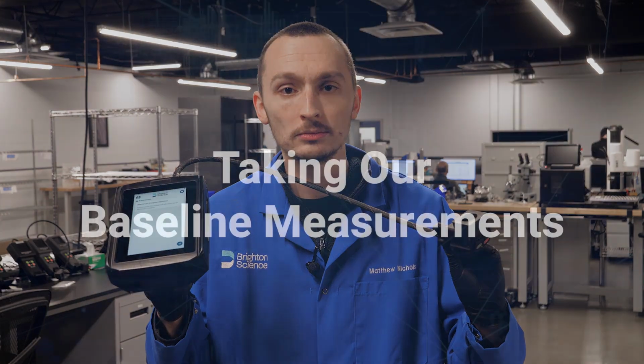One of the central aspects of maintaining a high standard of quality is intelligence and knowing the state of a surface. The tool that we'll be demonstrating today that quickly and reliably gauges the state of a surface is the BConnect.